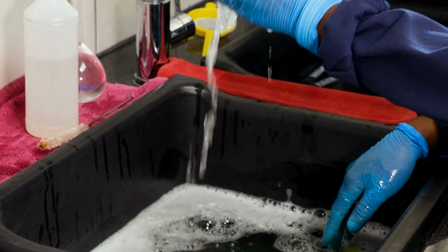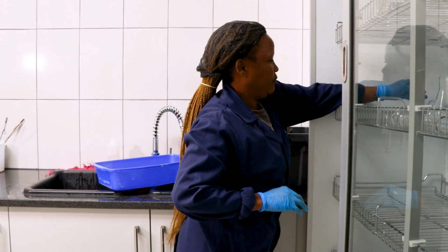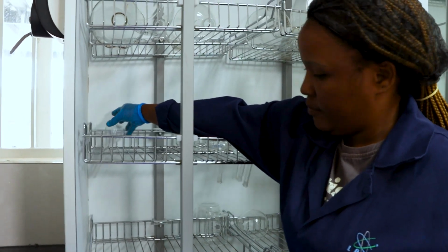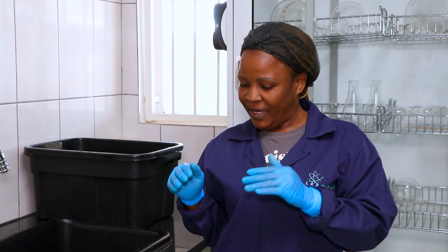I'm responsible for washing this glassware here. When I finish washing glassware, I put it in the oven, because the glassware must always be dry when the analysts use it. I'll make sure to take this glassware and put it in the cupboard, because everyone finds the glassware in there when they want to work.